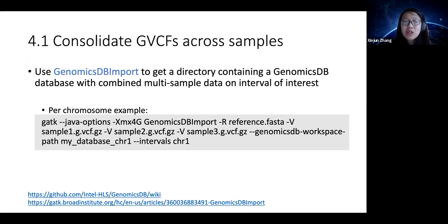That process is really slow, and it really depends on the size of your genome and also the number of individuals you have. I really don't recommend using that. You can run that if you're curious about how it works, or if you absolutely need a GVCF that contains all of the individuals, but just a warning that that function really takes a long time, and it may not actually be helpful depending on what you really want.